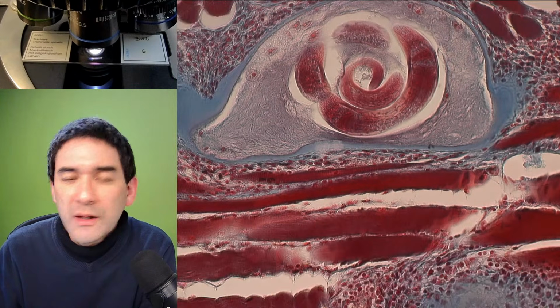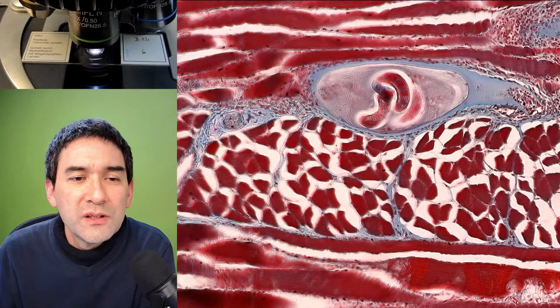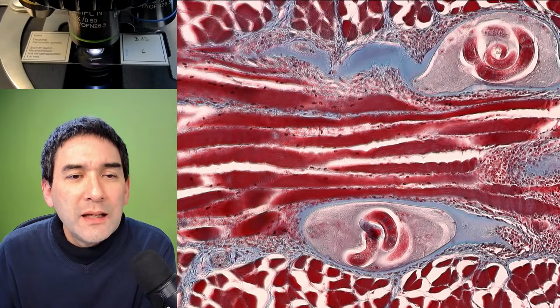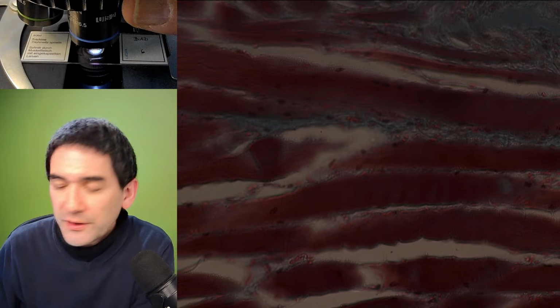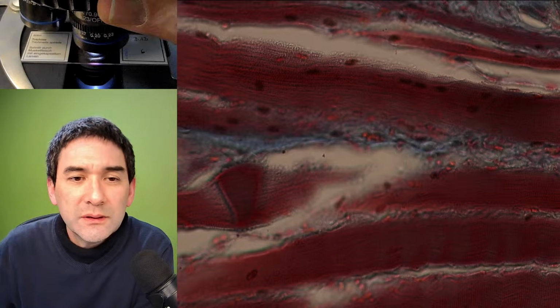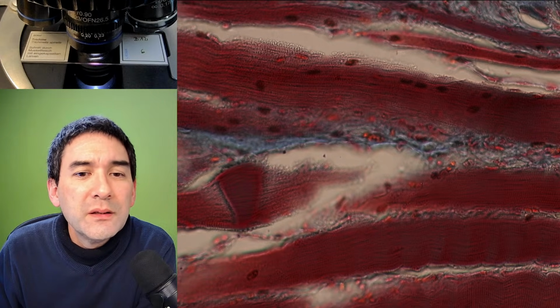So, but we can go down a little bit with the magnification. Here, for example, is another one. So it's another cyst that you have over here. So the reason why I like this slide so much is because you can actually see the muscle fibers quite well, and for this reason, I'm really going to go in. And here, I'm now at 60. Let's open it up a little bit.